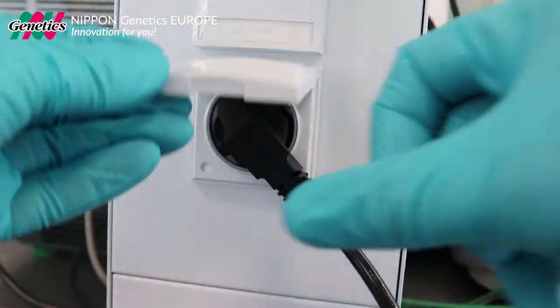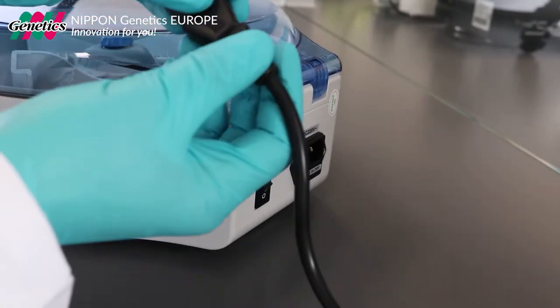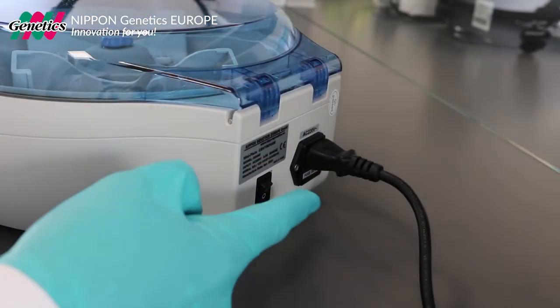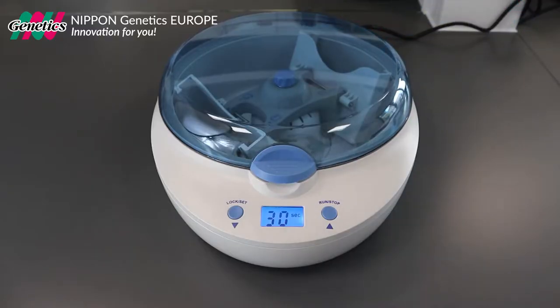Connect the centrifuge to a power socket and switch it on. The display will blink several times until it is ready to operate.